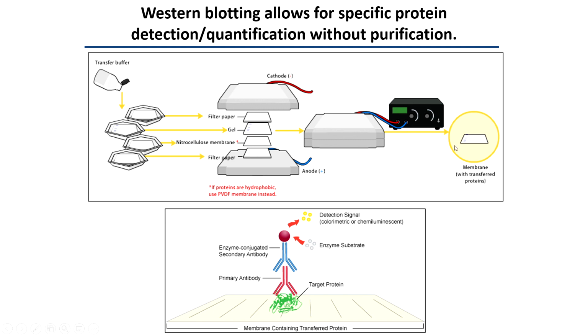And so what we have to do is make your protein of interest visible for detection. So now we have your membrane, which contains your target protein, and we can visualize your target protein using antibodies that bind to it very specifically. Antibodies bind their protein target with high specificity. And so if we design an antibody that binds your target protein, it will only bind this target and none of the other contaminating proteins in the gel. So the first step is to design this primary antibody that binds your target and apply that to the membrane.